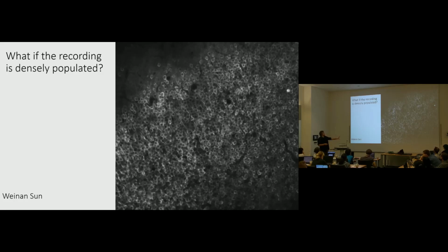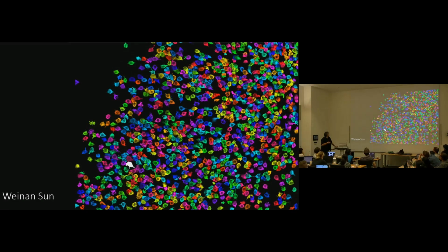And I think this will look like some of your guys' data, like in hippocampus. This is from Waynon, back there. So this is very densely labeled. So this is the kind of data set we'll be dealing with, team dense. And here are ROIs.